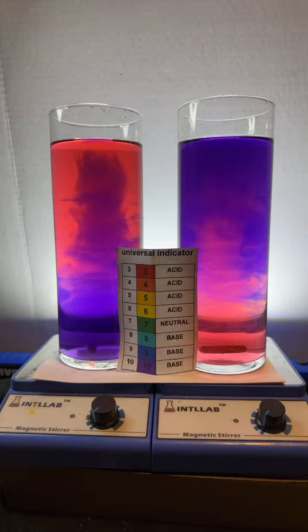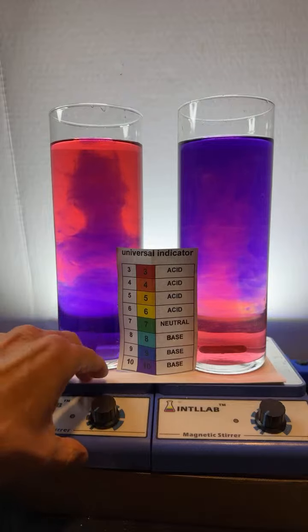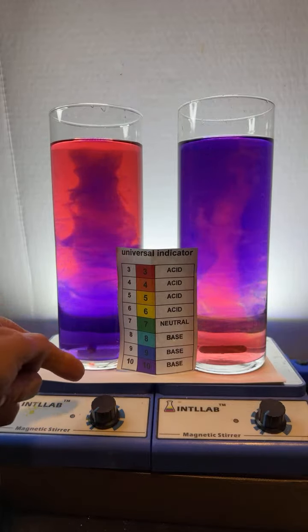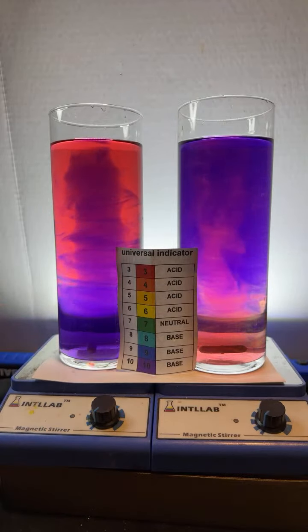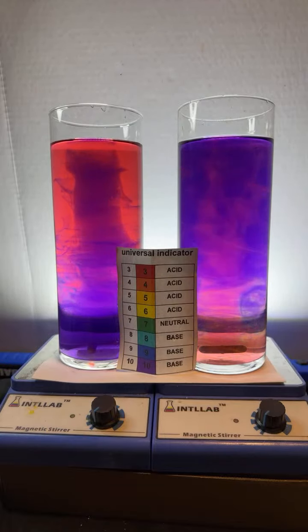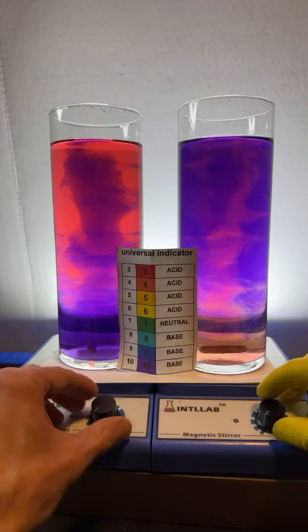How do you make that whirlpool? It's just a magnetic stir bar that's on a magnetic stir plate. So the stir plate, you can think of inside this box as like a fan with magnetic blades. And when the fan spins, it makes that little magnet on the inside of the flask spin. Put dry ice in one, then spin it fast, because why not, says Glorious. Yeah, we might do that. It is kind of pretty. Let's spin them and see what happens.